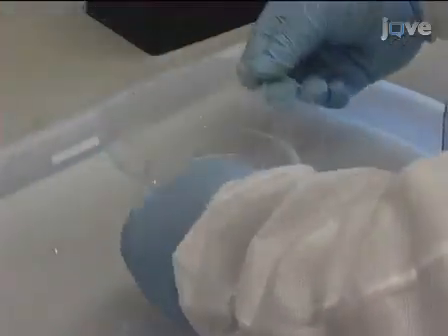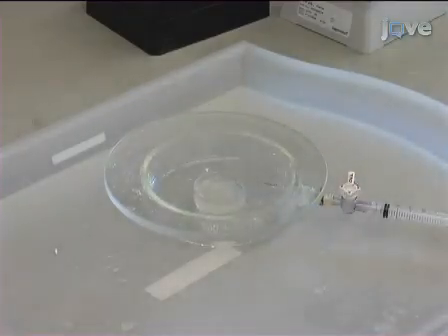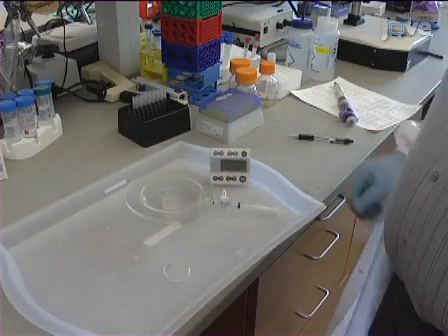Cover the seal where the optically transparent glass disc sits on the plate with high vacuum grease. Seal the chamber with the glass disc. Record the time as time 0.